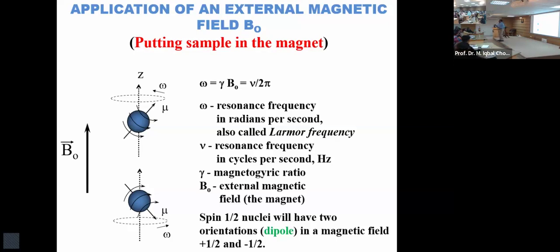You see, in certain cases, relaxation is so difficult that they have to add some kind of paramagnetic compound in order to facilitate it. So these compounds would have influence on the other. If you record the NMR spectrum of a steroid, cholesterol, in water, it looks different. If you record in DMSO, it will be different. So there is an influence. So I agree with you. Thank you, sir.